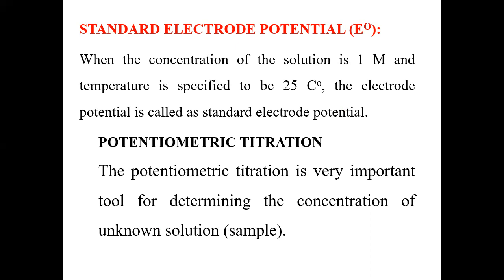So next topic, what is potentiometric titration? Potentiometric titration is a very important tool for determining the concentration of an unknown solution or sample.